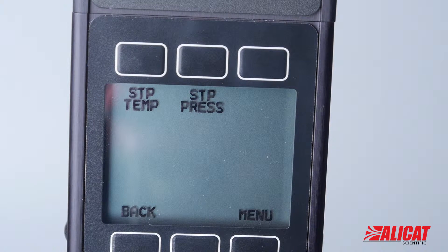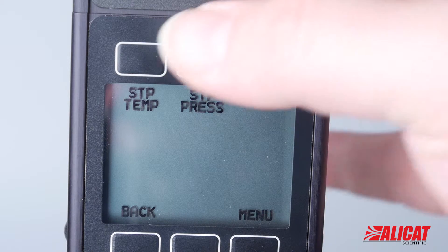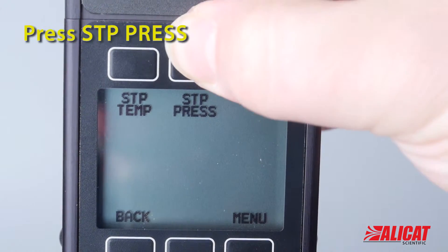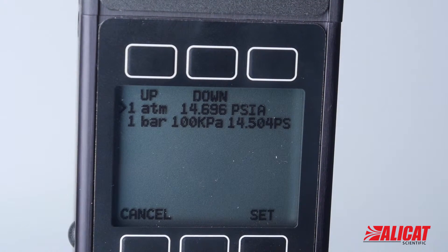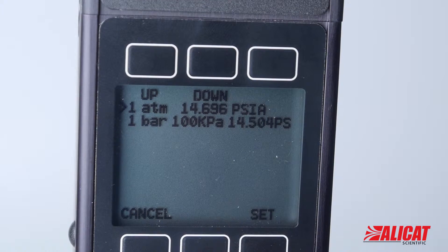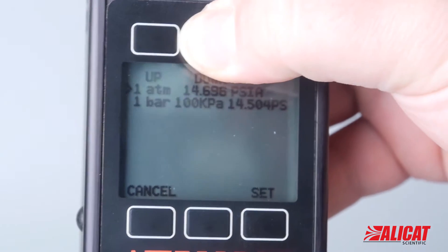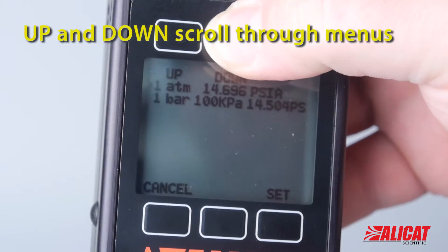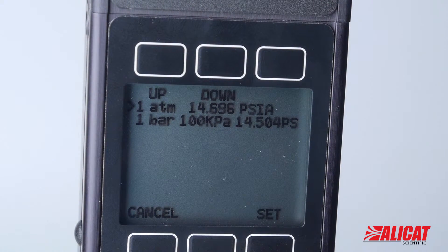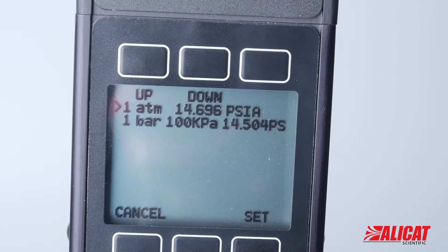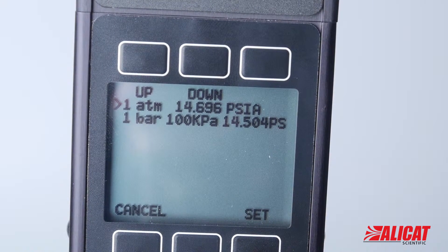On the STP menu we have STP temp and STP press — temperature and pressure. Let's look at pressure first. For STP pressure there are only two selections: one atmosphere and one bar, which you can toggle through with either the up or down button. The difference between those two STPs is very minor and we don't frequently change the pressure aspect of STP.